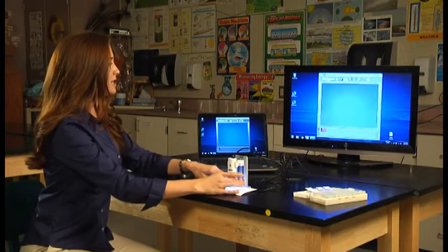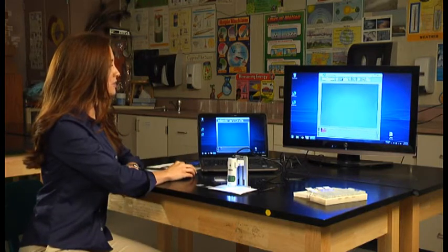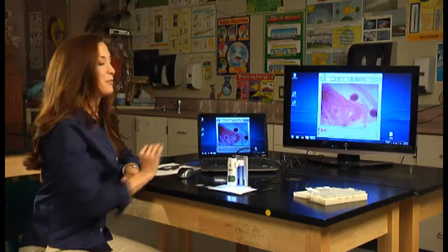In order to take a look at the picture, all you have to do is pick it up and drop it into the frame.